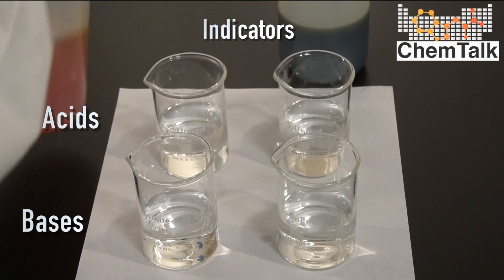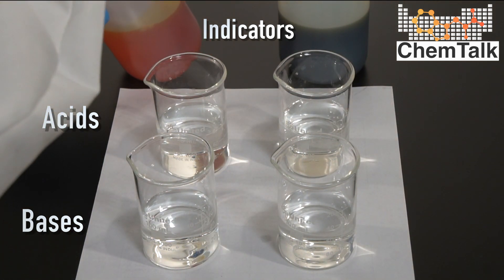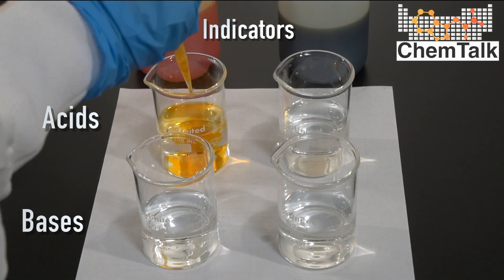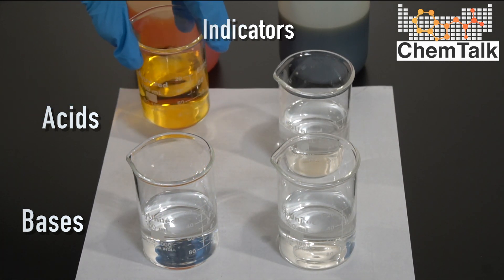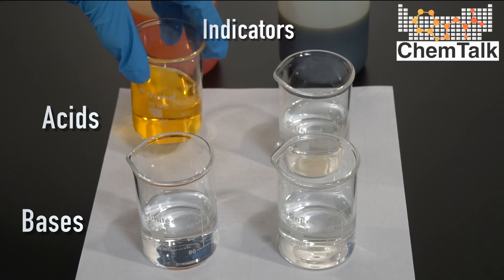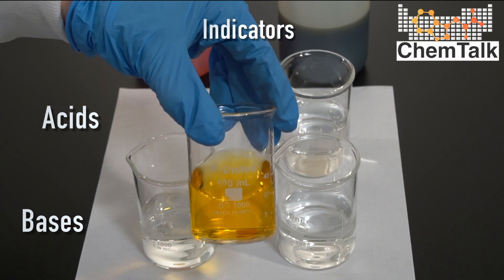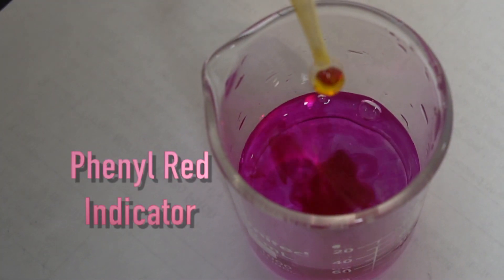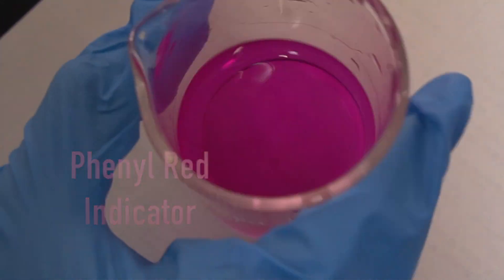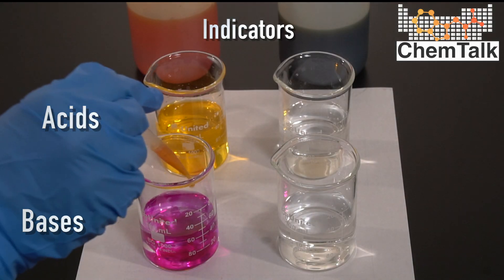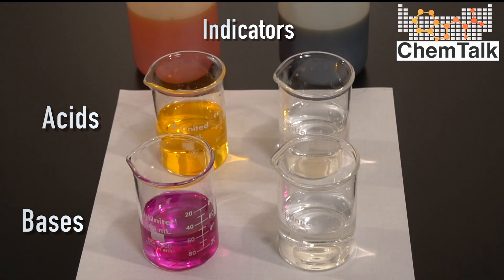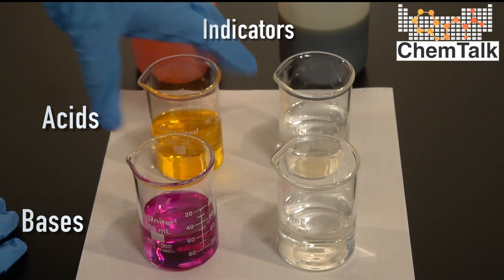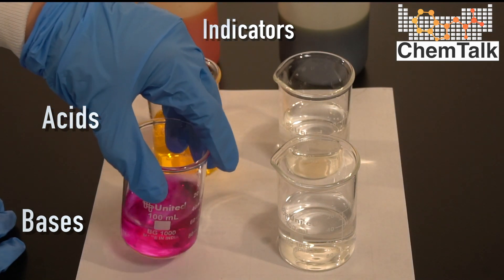So first I'm taking the phenol red, drop a bit into the acid, swirl it around a little. So we have an orange yellow color here for the acid. And now let me drop the same indicator, the phenol red, into the potassium hydroxide solution. And that's very different, right? Now we have this deep purple color. So for the phenol red in acid, we have a yellow orangey color and in base, we have purple.